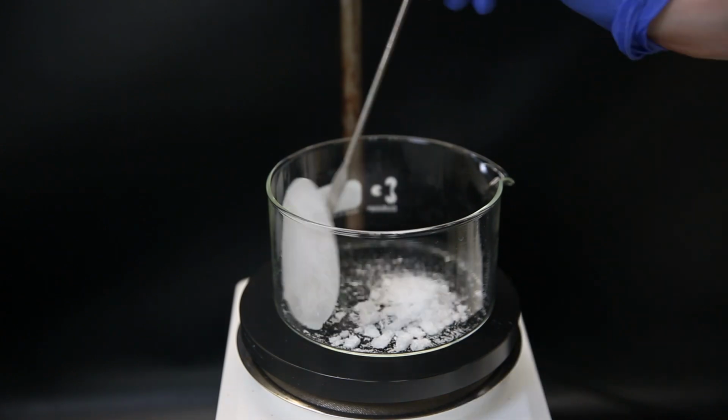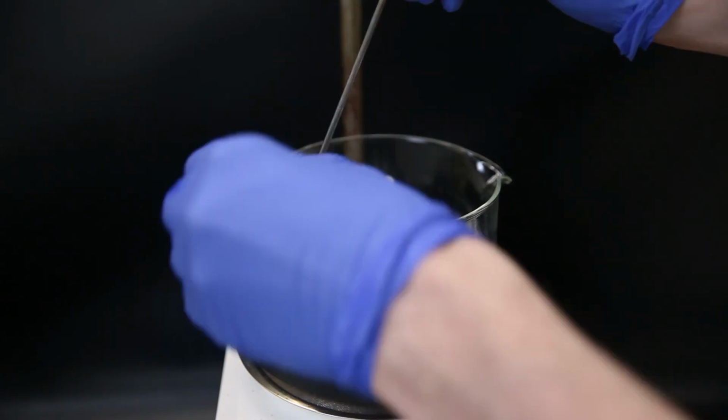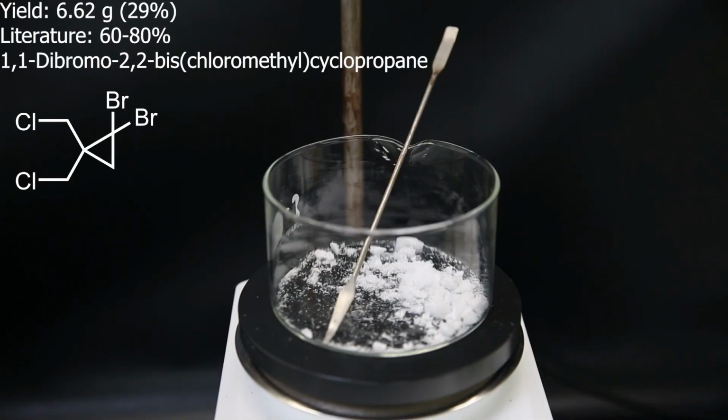I then put it all into a crystallizing dish, and the yield turned out to be 6.62 grams, which is 29%. It is a lot lower than literature, but at least it is enough to continue. The smell of 1,1-dibromo-2,2-bis(chloromethyl)cyclopropane is very artificial, sweet, and aromatic, but it is so strong it becomes nauseating from up close. From far away, the smell is quite pleasant.